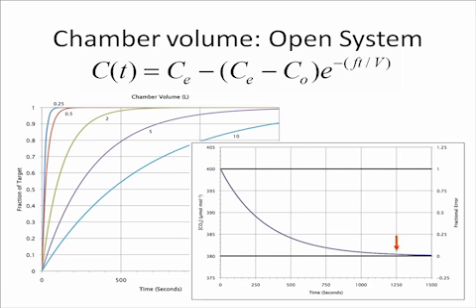Here we have a 5-liter chamber and 700 micromoles per second flow rate, and have done something that will result in a 20 ppm change in this chamber CO2 concentration. This could be placing an actively photosynthesizing sample in the chamber, or if we're using the 6400, it could be simply asking for a different, lower CO2 concentration.